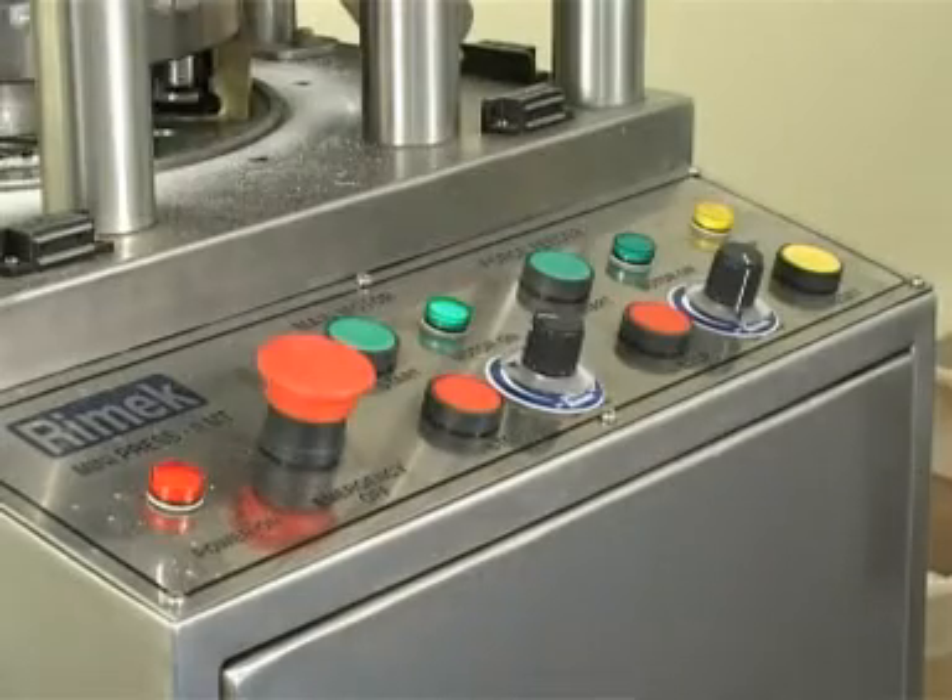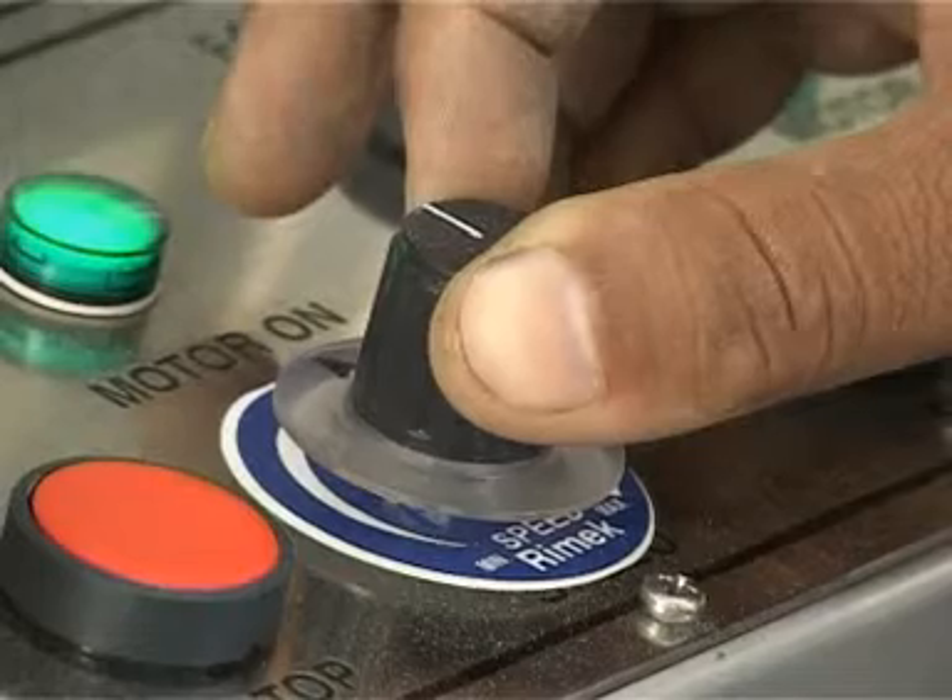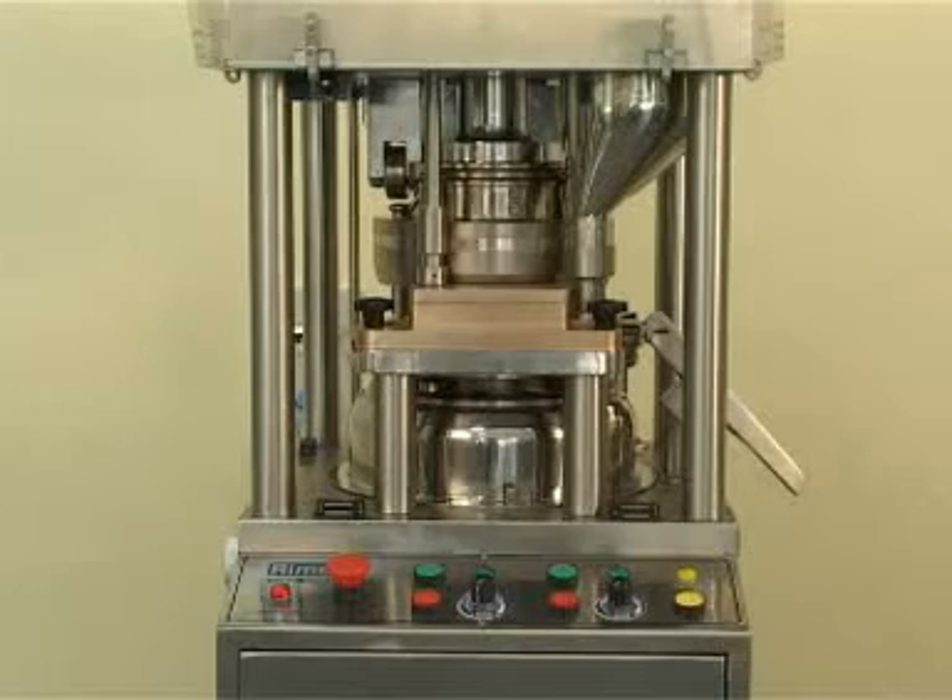The speed of the turret and feeder is controlled by a potentiometer through an AC drive. The machine will trip off in an emergency and stop any overload on the machine.